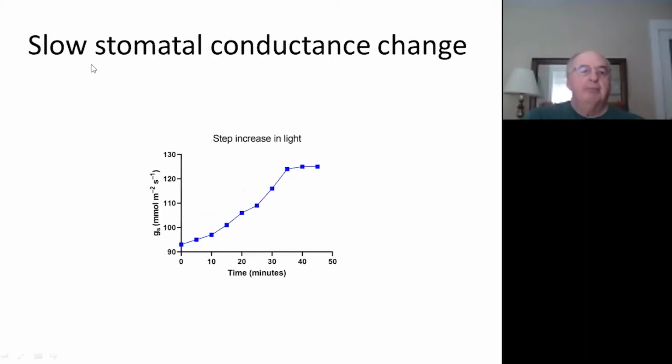The answer primarily is slow changes in stomatal conductance. And this is a plot now of stomatal conductance against time. It's still only doing roughly a 30% change, but you can see it's a very, very slow, gradual response, and it takes more than 30 minutes to get there.